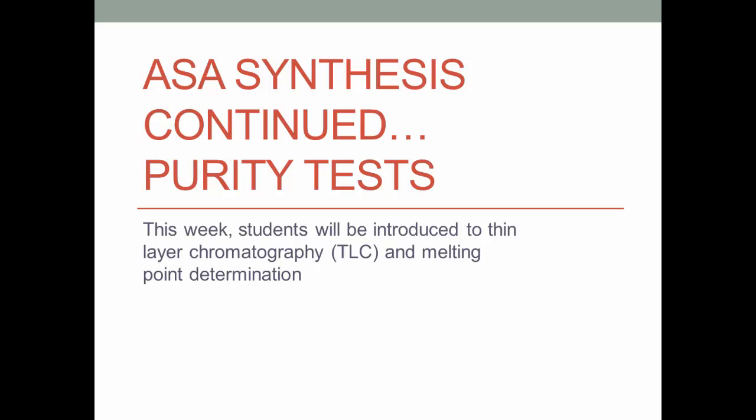Synthesis of Acetylsalicylic Acid Purity Tests. This week, you will be introduced to Thin Layer Chromatography, TLC, and Melting Point Determination.